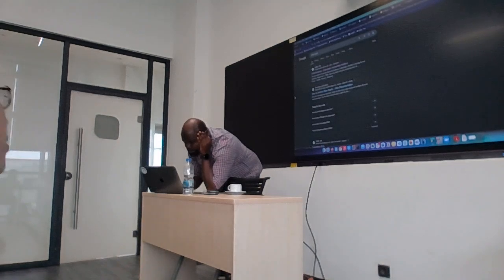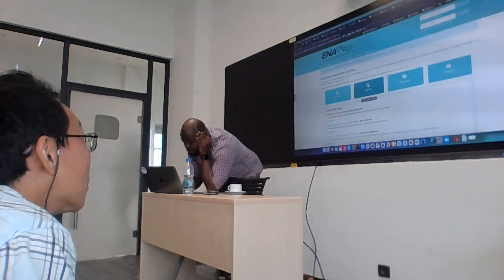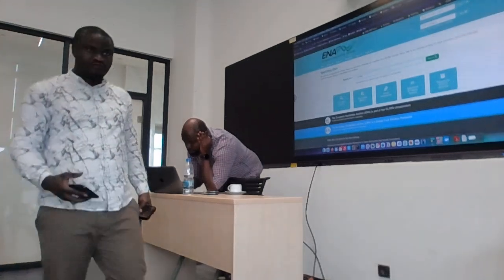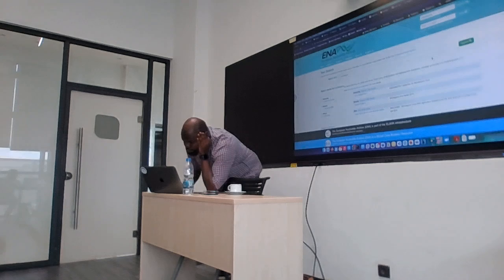Maybe just agree to the bottom, just agree. Shouldn't affect, but still searching. Okay. It was me who was impatient.